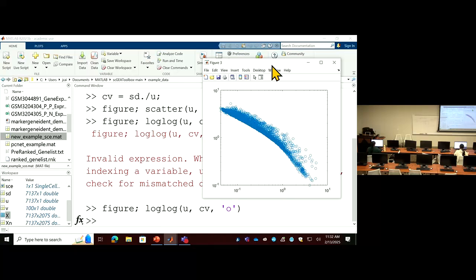Yeah, so just remember this figure from real data. We are going to come back to this relationship later when we define the way to find the highly variable genes. Those genes are special ones that jump away from this regression, because you have 7,000 genes and most of them fit this curve nicely. Those special ones are functionally more important. They jump away from the curve, at the same level of average, and have higher than expected variability.